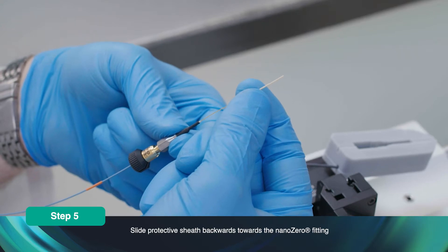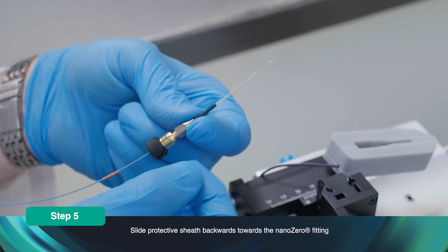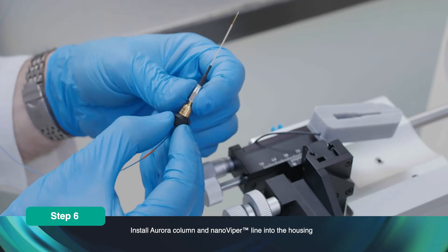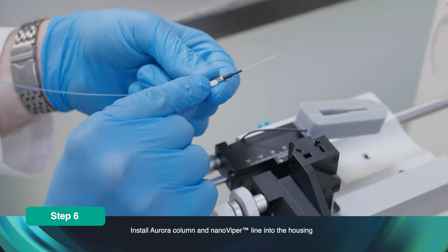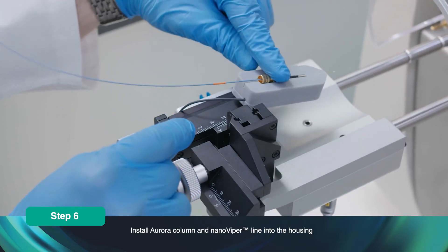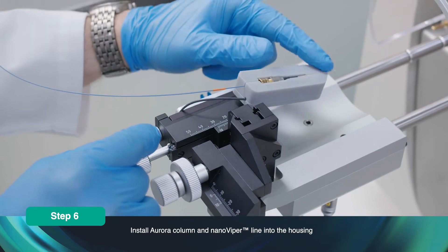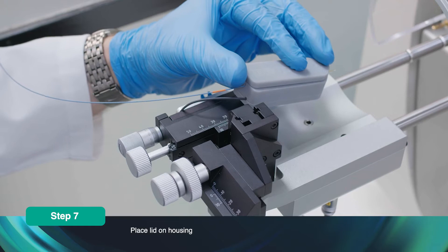Expose the emitter tip by sliding the protective sheath towards the Nano Zero. Install the Aurora column and Nano Viper line into the housing. Place the lid onto the housing.